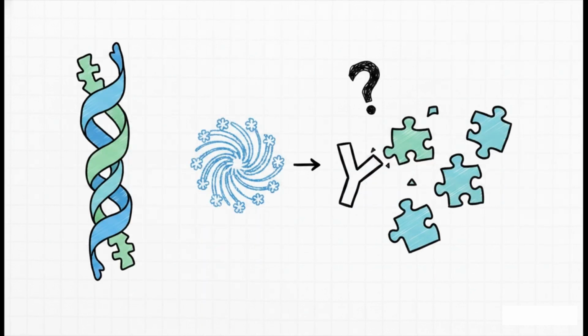Finally, sometimes the biology itself is just tricking you. If your assay definition isn't incredibly tight, complex target biology and sample handling will cause false positives. Are you measuring intact analyte, a single isoform, or a cleavage product? If your sample handling involves multiple freeze-thaw cycles that generate degraded fragments, your antibodies might bind those fragments unpredictably. The assay is actually behaving exactly as designed, but the biology has completely shifted under your feet.